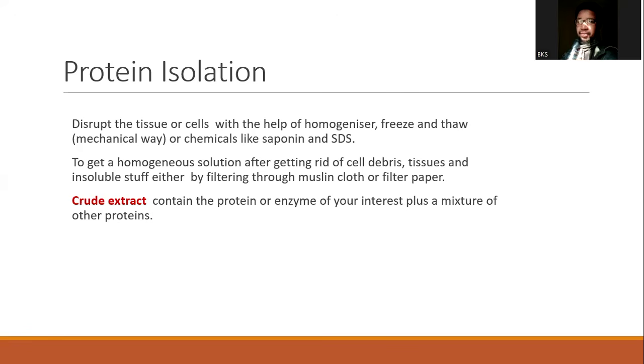If the proteins are found within the cytosol, then you extract the cytosol content. You collect the cytosol content, and from there you know that your proteins are there. You discard the remnants, the organelles. But if your protein is found within any of the organelles, then you have to isolate these organelles.